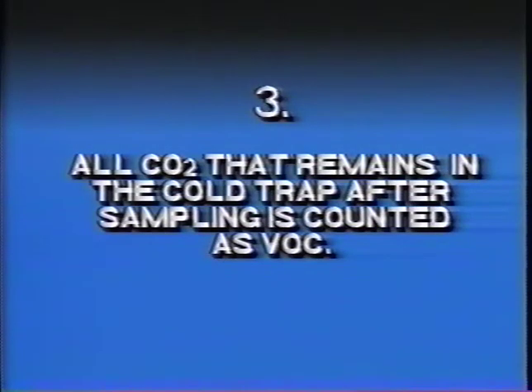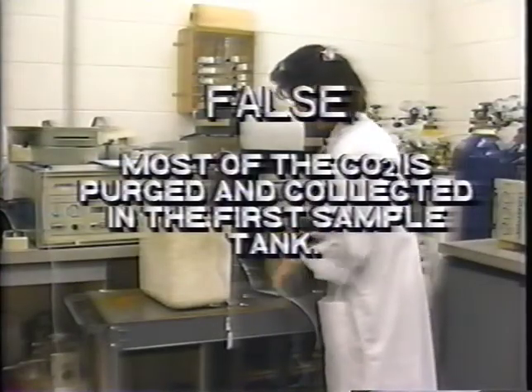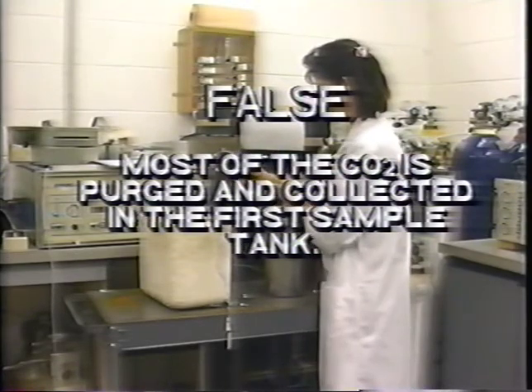3. All CO2 that remains in the cold trap after sampling is ultimately counted as VOC. False. Most of the CO2 in the cold trap is purged with zero air and collected in the first sample tank.